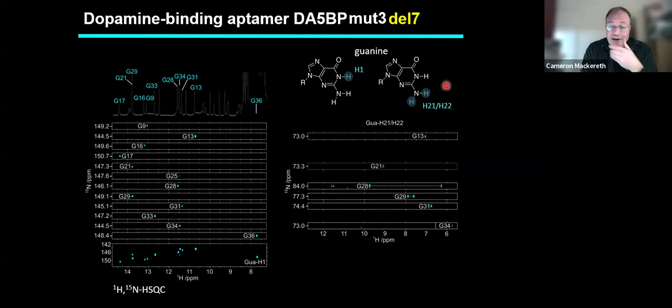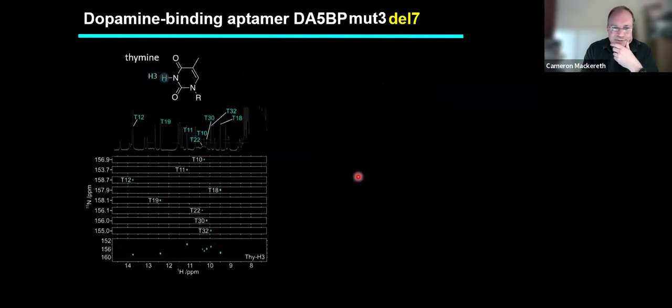So we were quite surprised that actually we saw many of these hydrogens in the particular DNA aptamer we were looking at. And so you can see it's in a different region of the spectrum. This value is 6 to 12, so it's to the right of these signals. But they're typical of amino groups. So that means there's a lot more hydrogen bonding going on than is usually expected in DNA structures.